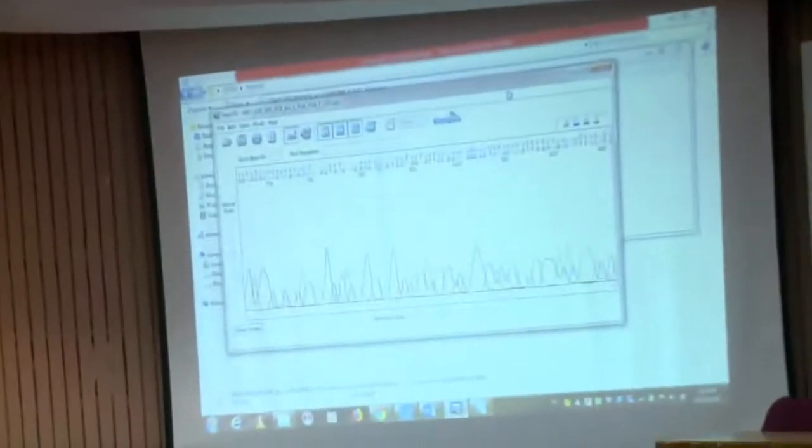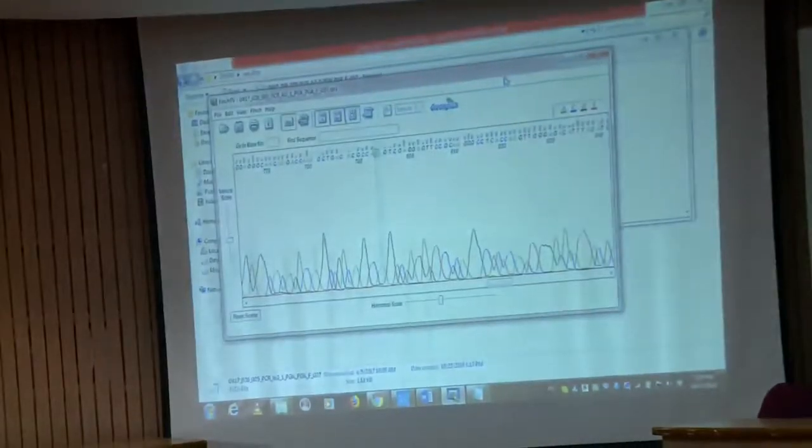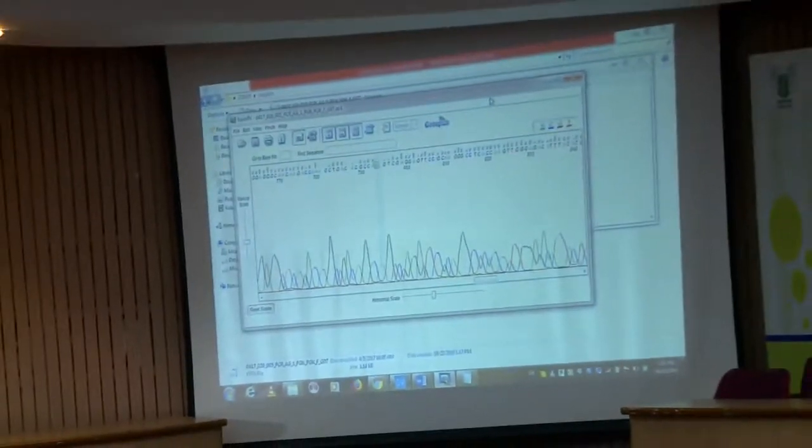One more freely available software is there, that is Bioedit, that also you can write down. Bioedit software that you can download and use offline. I will just show you how to import those files, and there are other software also. CLC is also there. There are plenty of software for all these applications, right.